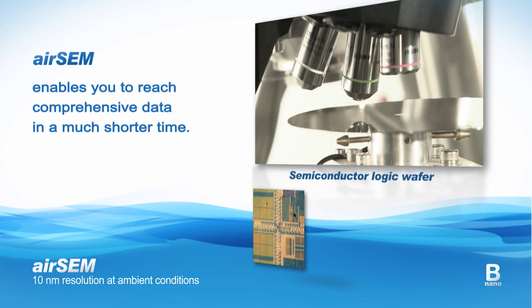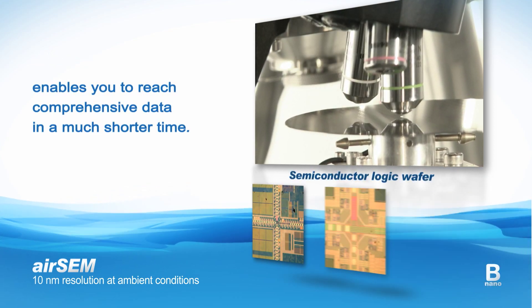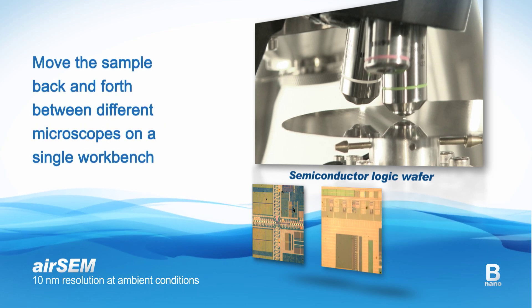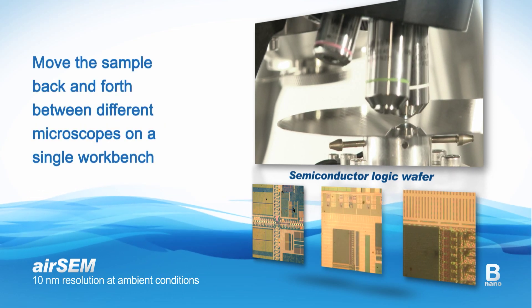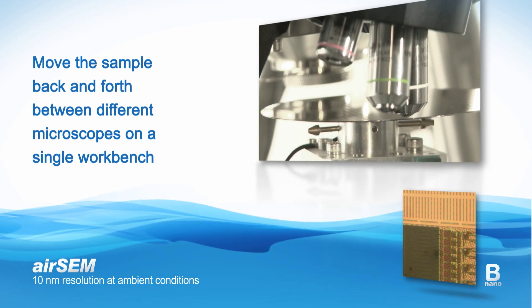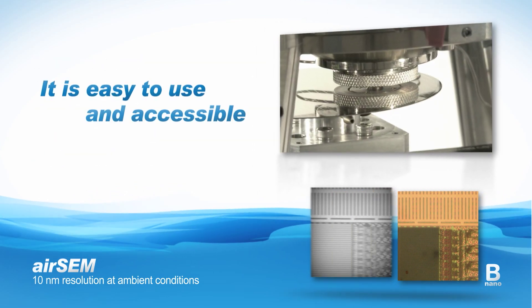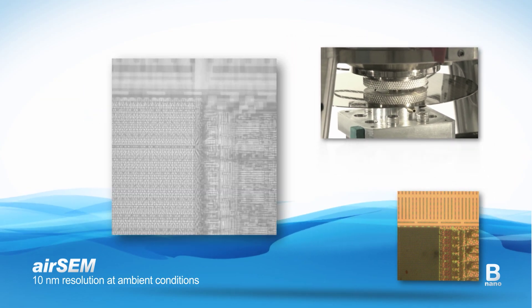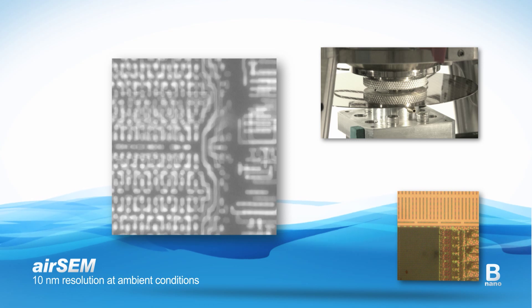Using the airSEM enables you to reach comprehensive data in a much shorter time. With the airSEM, you can seamlessly move the sample back and forth between different microscopes on a single workbench. It's easy to use and accessible, while providing the higher resolution and the material analysis capabilities of the SEM.